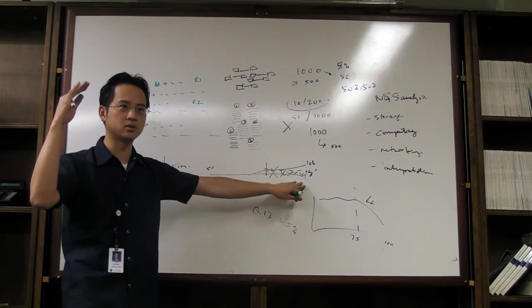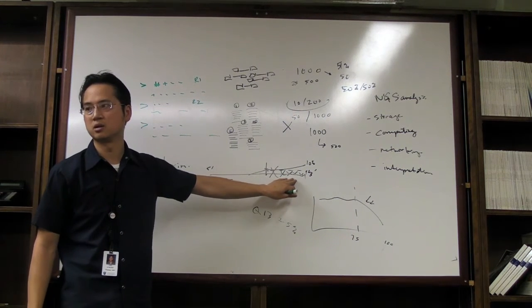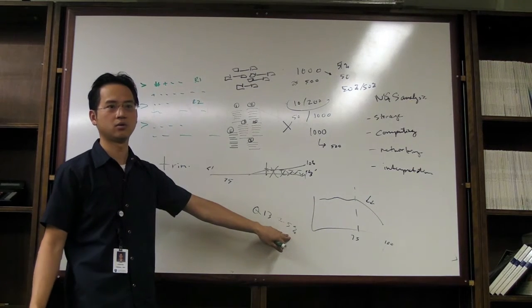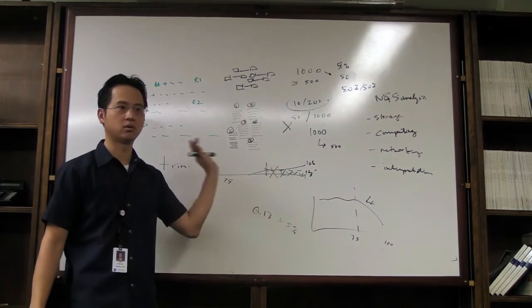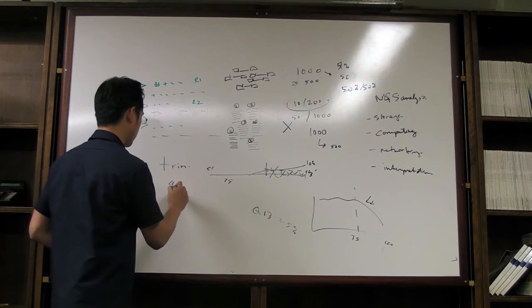It's going to map erroneously, for one. And two, when you do allelic mutation calling, it's going to give you a bad mutation call anyways. Chances are 1 out of 20 that it's going to give you a wrong call. So you might as well just cut your losses and just deal with the good part. So quality trimming is one way.